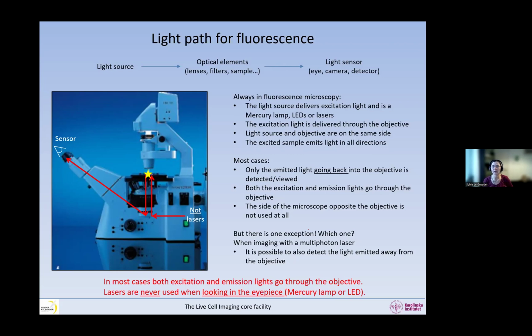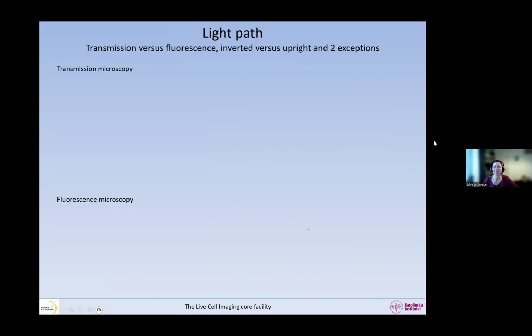That's not the case for other systems. That is because the laser light on a single point confocal is very focused into one point. It would be very dangerous for you to get it into your eyes because of this very high power. This is not the case in wide field microscopy, for example. So we are going to become expert at all this today.